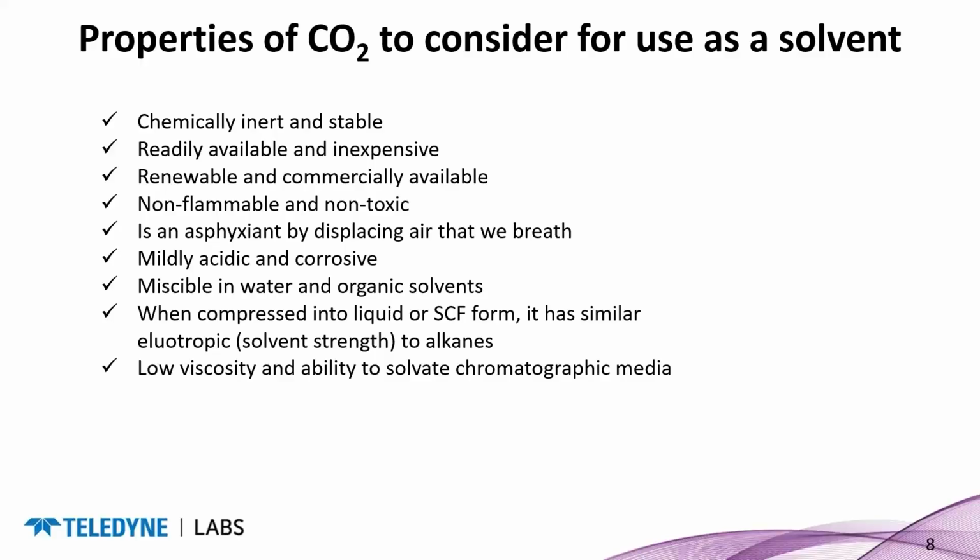It is miscible in water as well as all the organic solvents, which is a great feature, so we can use the spectrum of solvents available commercially. When it is compressed into a liquid, or even at higher pressure and temperature in SCF form, it has similar solvent strength to that of an alkane. So it behaves pretty much like heptane or hexanes, except that it is mildly acidic.